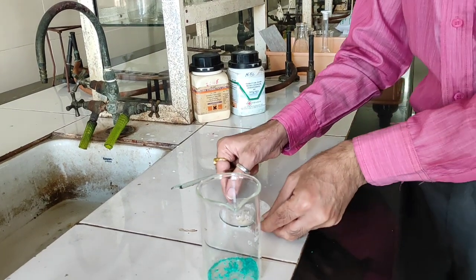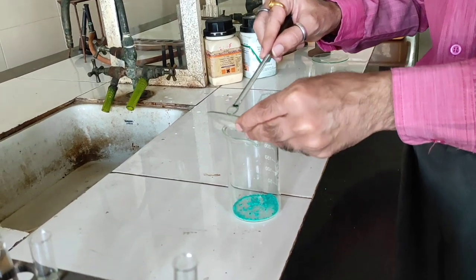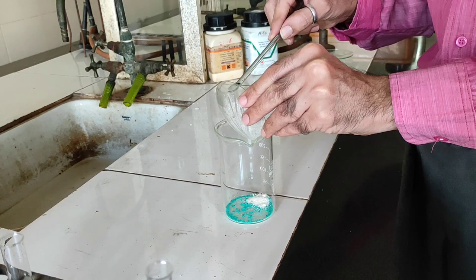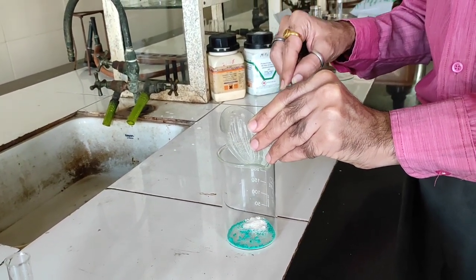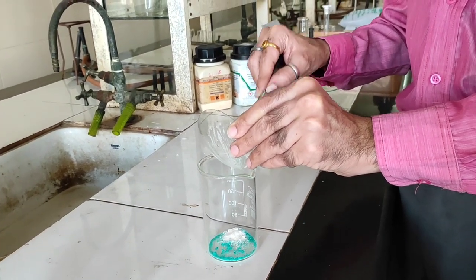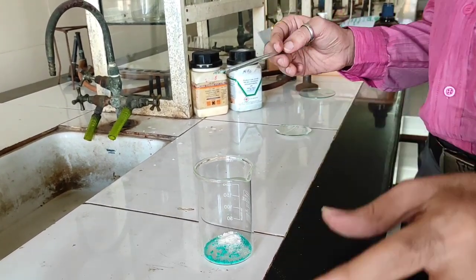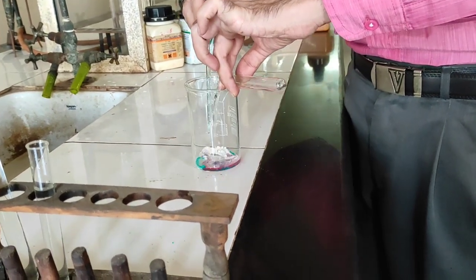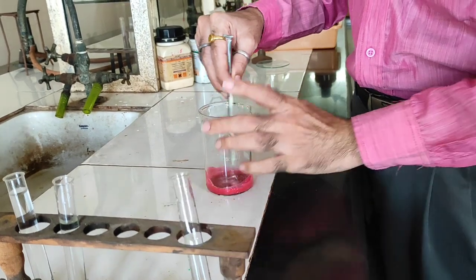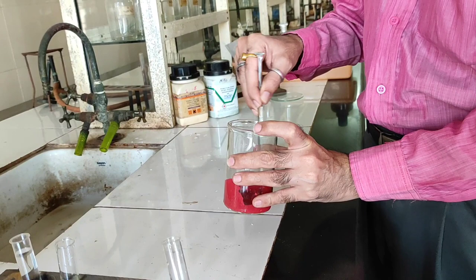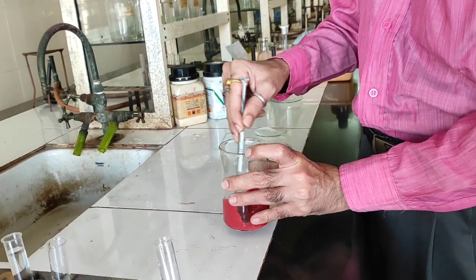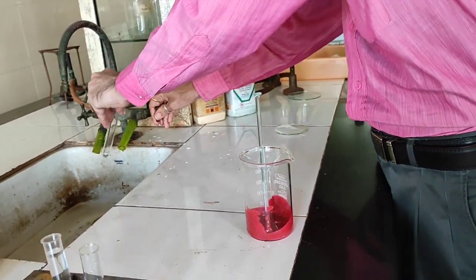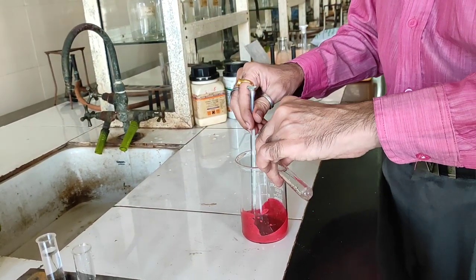Now into this we are going to add around 1 gram of the sodium salt of DMG. We are going to mix that and dissolve this in distilled water. You can see the coloration which is being obtained, the scarlet red precipitate that I was talking about.